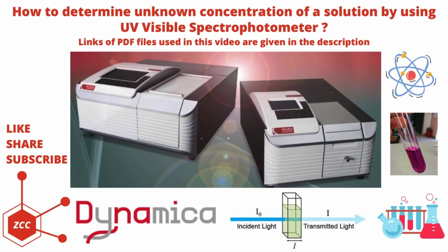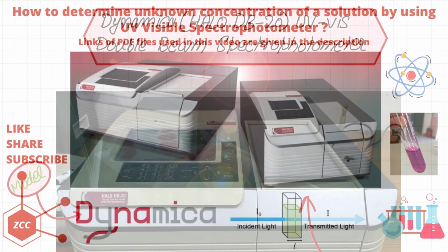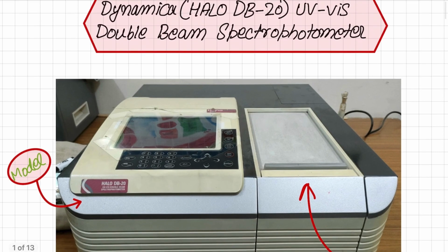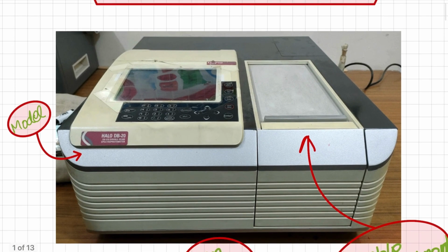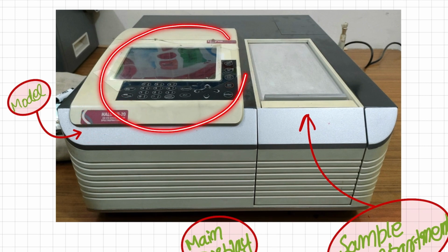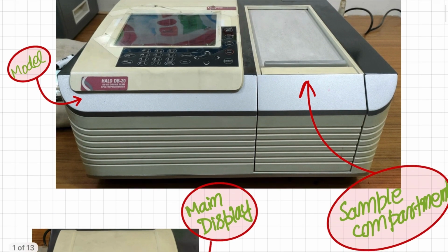So this lecture is about how to determine the unknown concentration of a solution by using a UV-Visible Spectrophotometer. We are using the Dynamica HALO DB-20 UV-Visible double beam spectrophotometer for this experiment, and this is the main model of this instrument, and this is the main screen from which we operate all the processes, and this is the sample container which is covered.